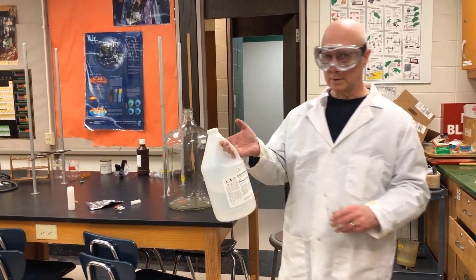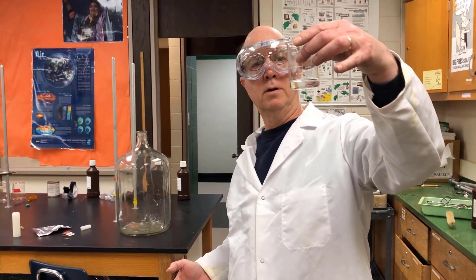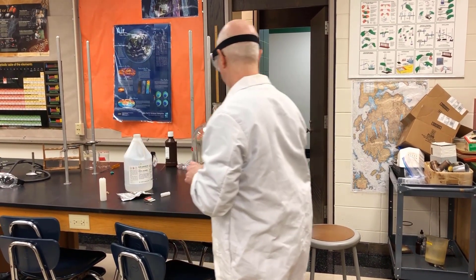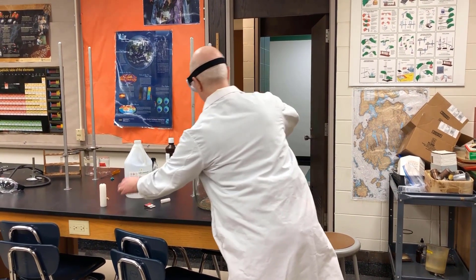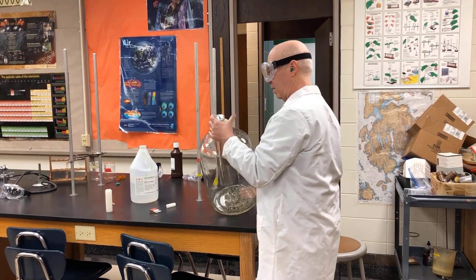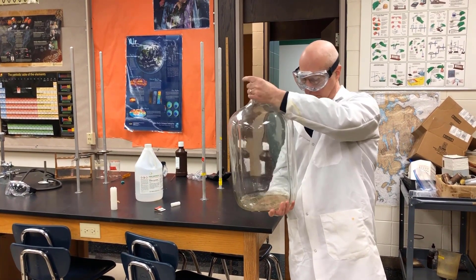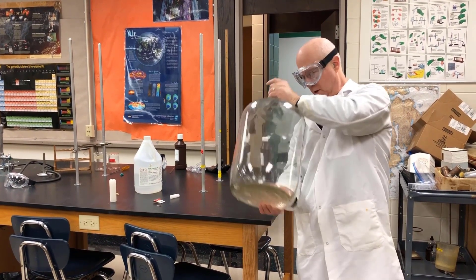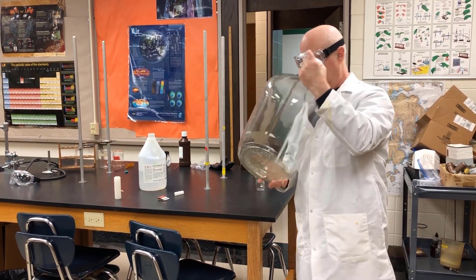So this is ethyl alcohol. I poured some in here — 20 milliliters. I'm going to pour it in this jug and cover it. I'm going to shake it because I want the alcohol in vapor form, and alcohol evaporates quite readily. It takes a little while.